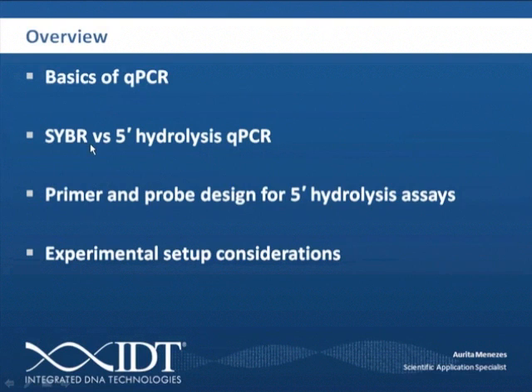We will then discuss some differences in capabilities between SYBR and 5' hydrolysis qPCR. I will go into more detail on primer and probe design criteria for 5' hydrolysis assays, and finally give you all some suggestions and ideas on setting up experiments.